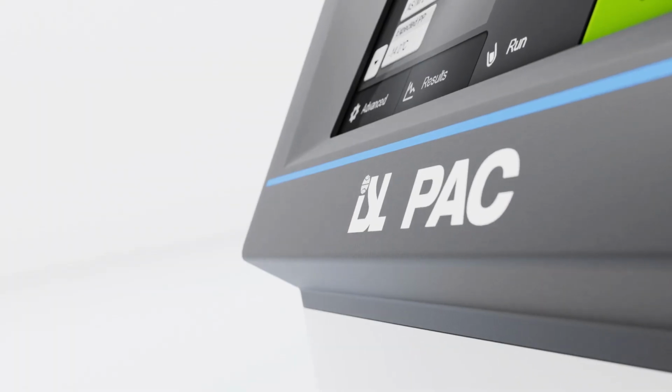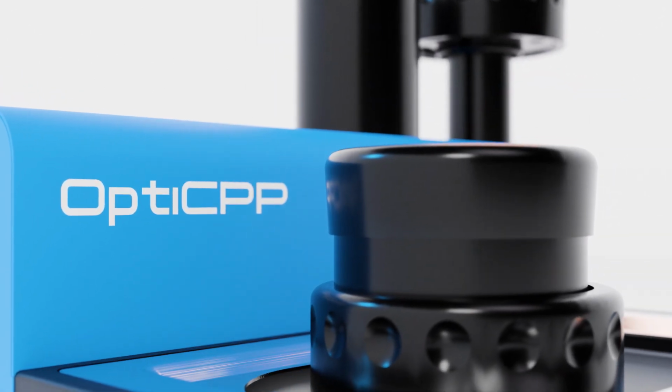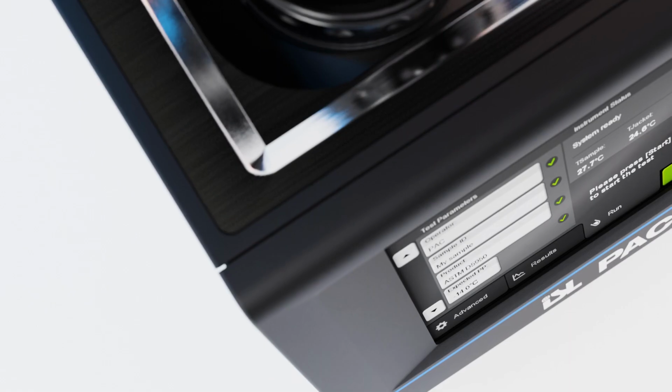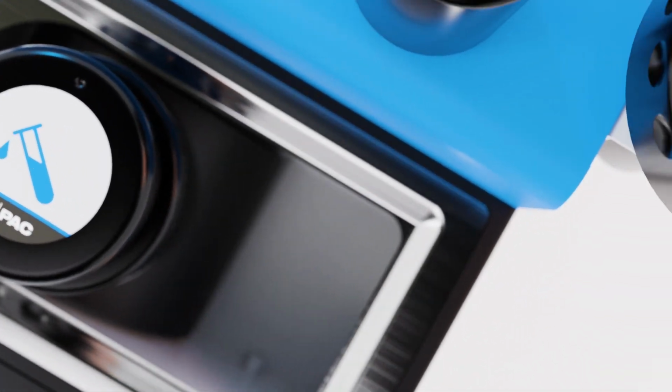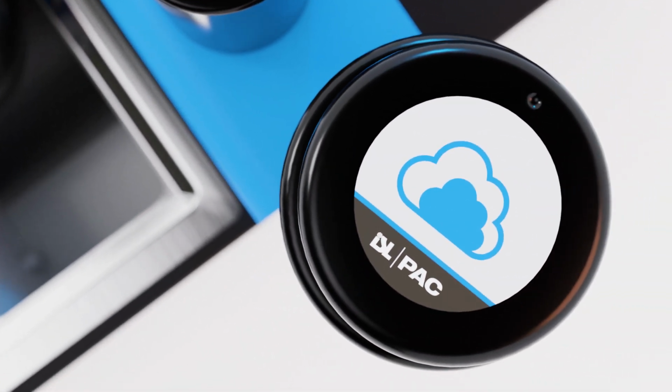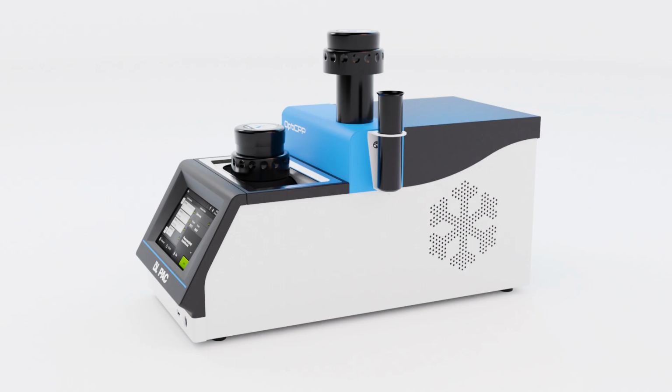OptiCPP provides a stable and reliable platform, common to other PAC instruments, that's easy to use and provides real-time results that allow users to evaluate the quality of their fuels and lubricants. A revolutionary built-in cooling system allows testing samples below -95°C.